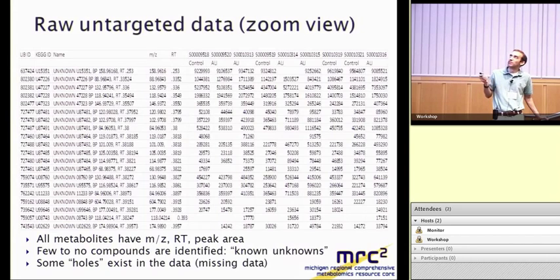And then we have our samples. So we have control and acute lung injury, also known as acute respiratory distress syndrome, patients. These are the patients, and these are the features. We don't want to really call them metabolites yet, but the features that were detected in all of the patients. And so we have some holes, things which, even in spite of recursive processing, we have missing data. And that's another characteristic of untargeted metabolomics. Some features will be present and found in all of your samples. Some features may be missing in specific samples. Maybe they'll be missing in the control samples and present in the experimental group. Maybe they'll be a random distribution throughout your samples.